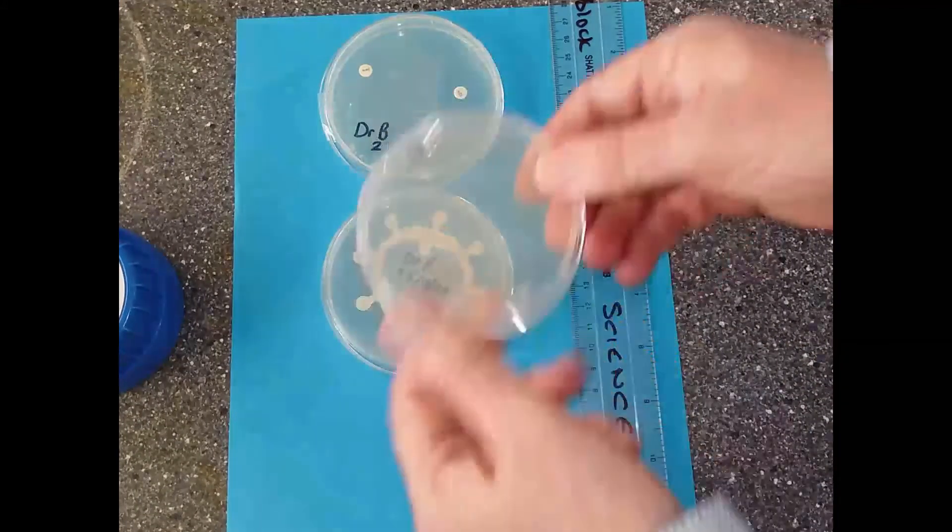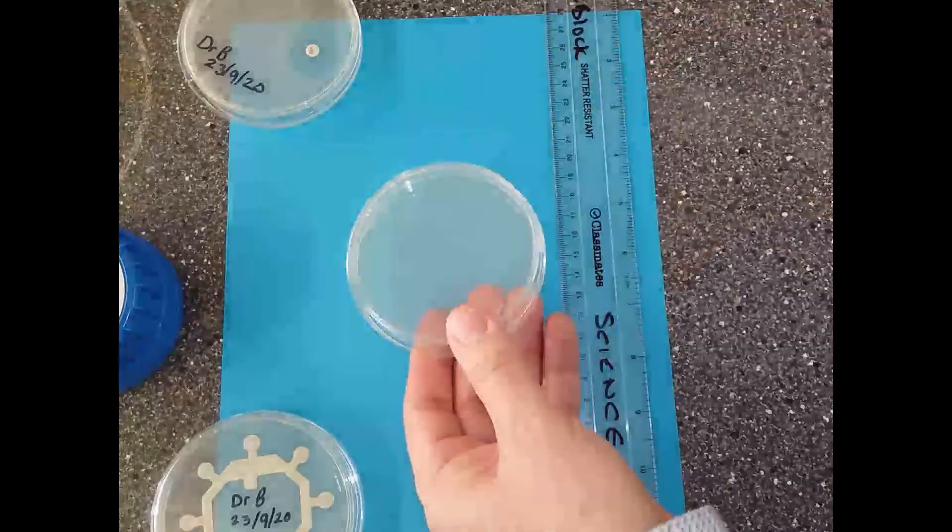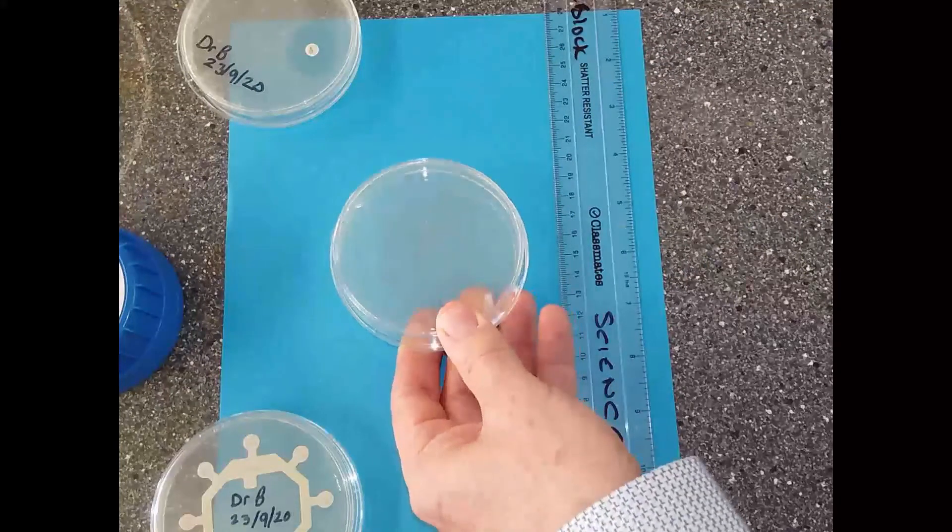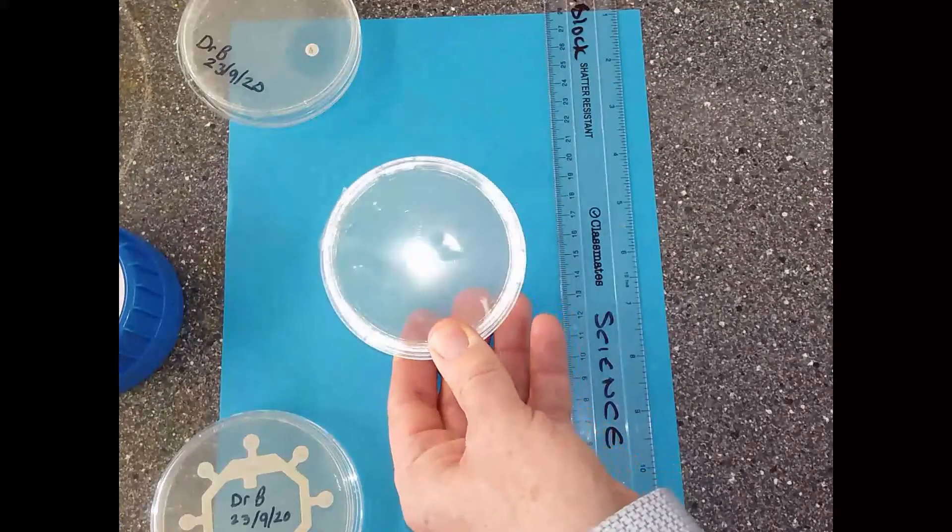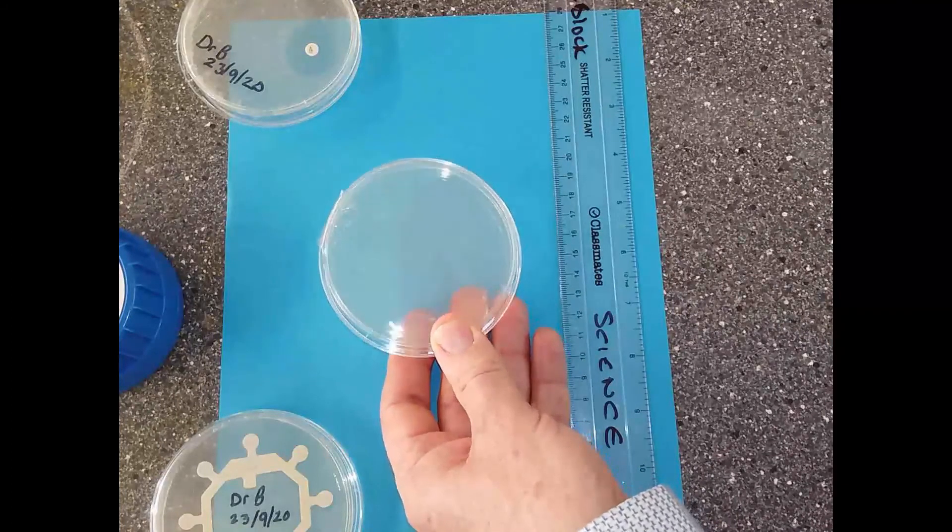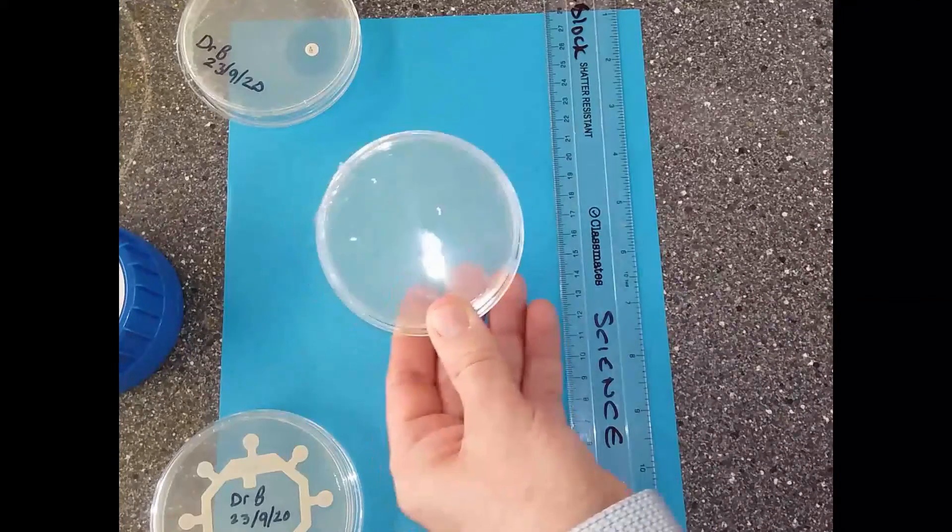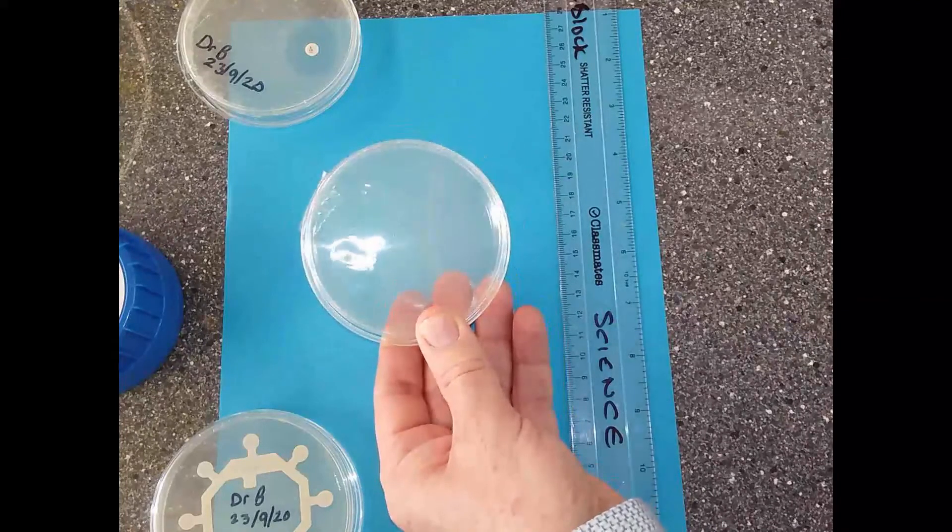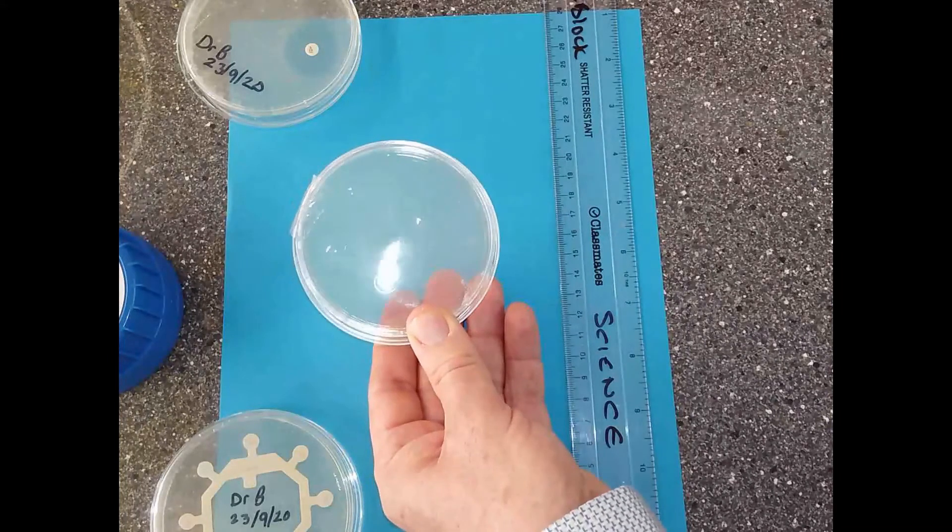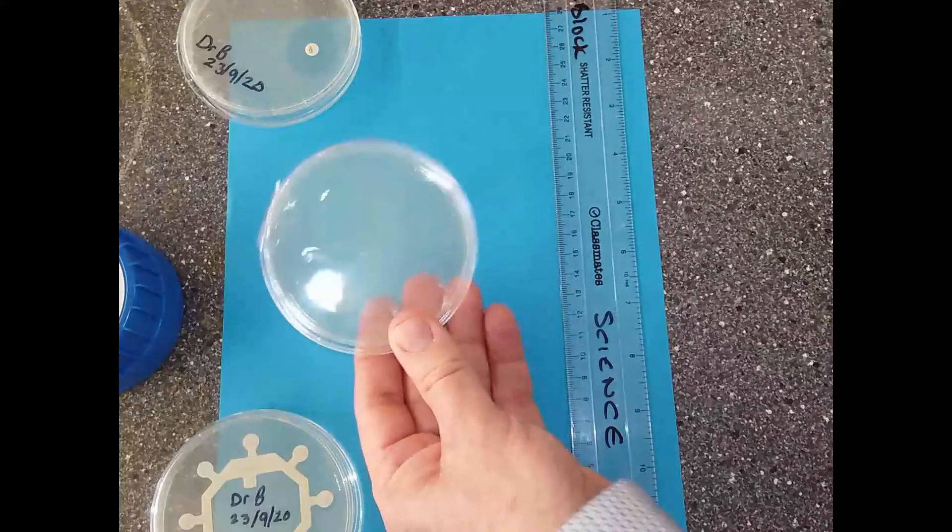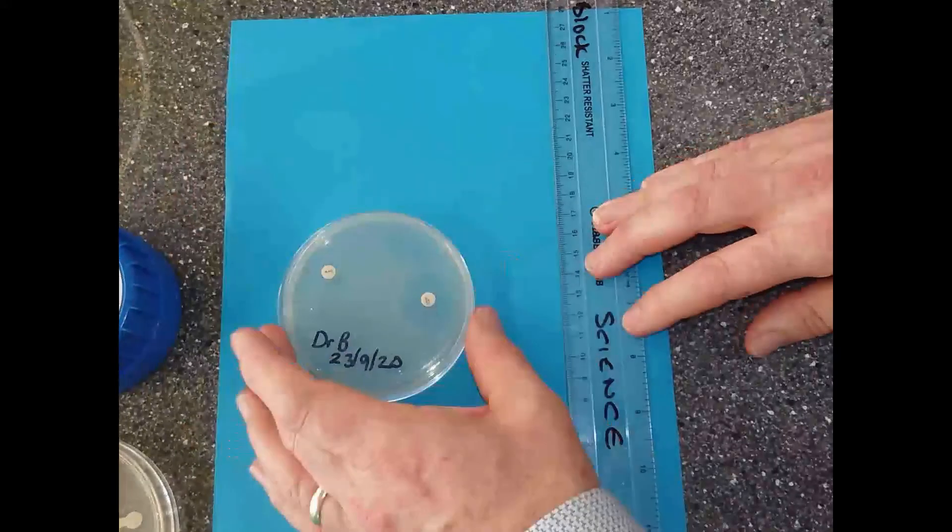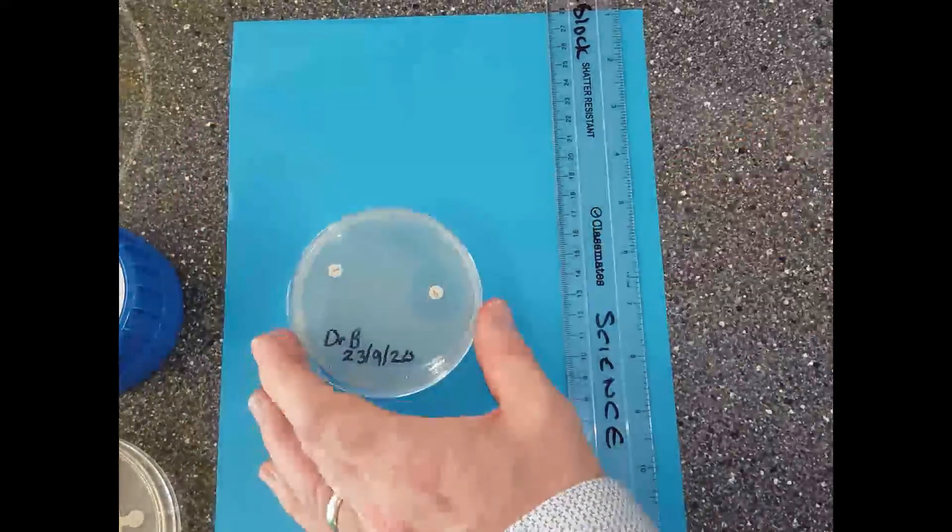I'm going to show you the first one - this one here was the one I spread the agar on yesterday. You can see pretty much it's uncontaminated, so there's no other cultures there. You can just see it's kind of a dark gray color. That's the E. coli that has been spread inside it. You can see there's no contamination whatsoever.